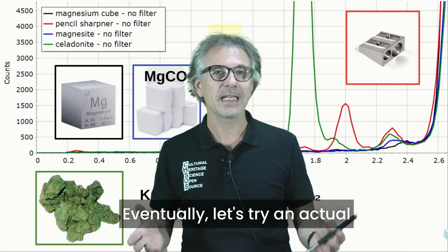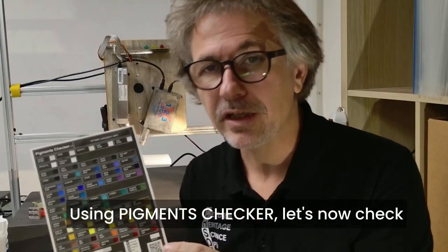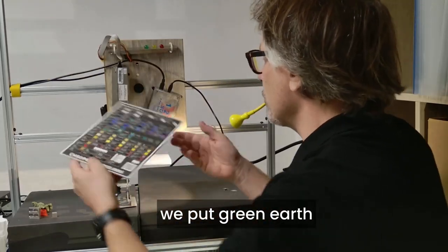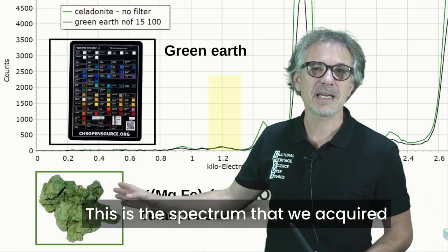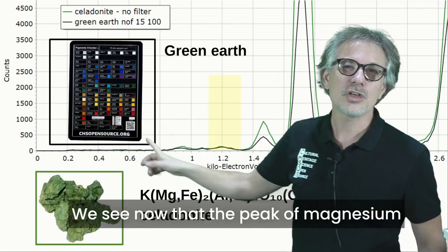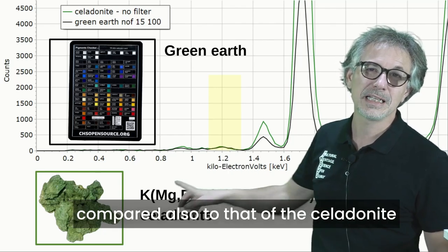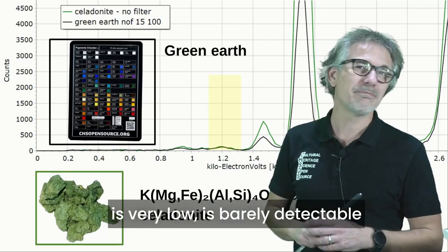Eventually, let's try an actual pigment containing magnesium, green earth. Using a pigment checker, let's now check the spectrum of green earth. We have it over here, and we put green earth under our spectrometer. This is the spectrum that we acquired from the pigment checker, the green earth. We see now that the peak of magnesium, compared also to that of the celadonite, is basically the same thing: very low, barely detectable.